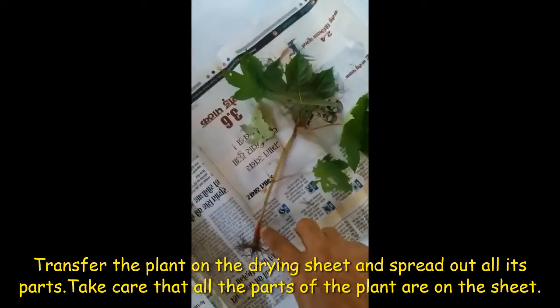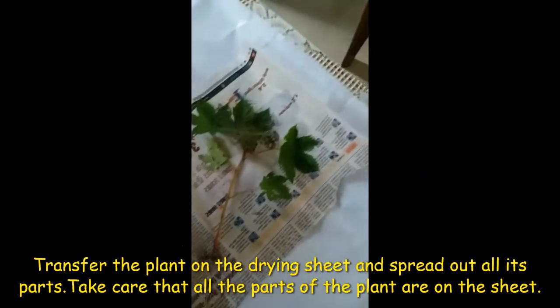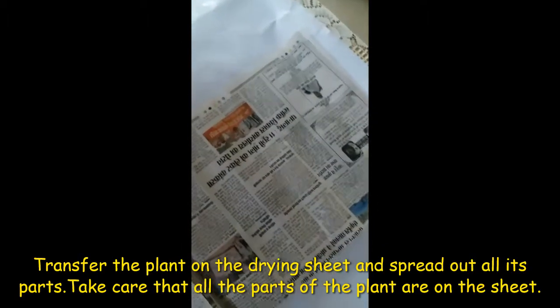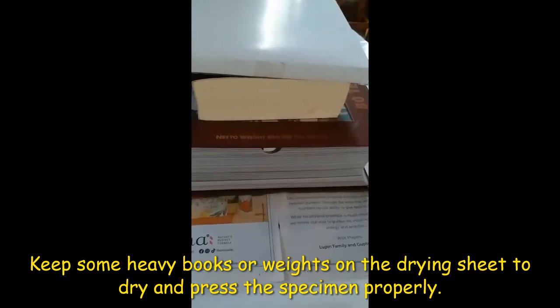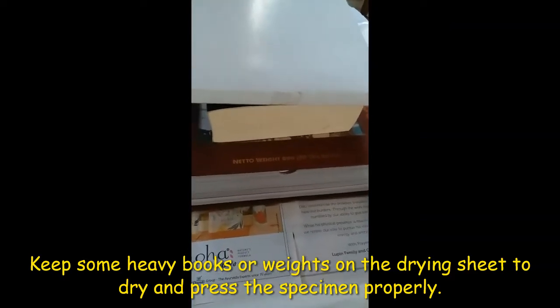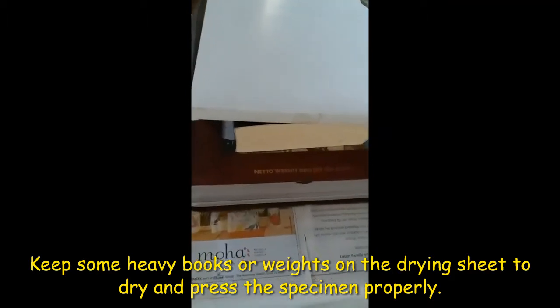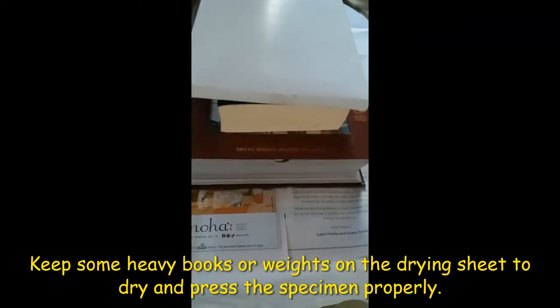The root should be spread out nicely, and then it should be covered with another sheet of paper. Now put some heavy books on the sheets. Make sure that every part of your plant is inside, because if any part is outside the sheets, that part will turn yellow, it will shrink, and you will not be able to paste it on the herbarium sheet. Leave this setup for at least one week before you disturb it.